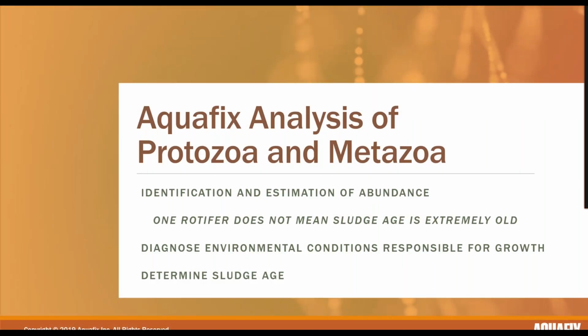And so with all of these protozoa and metazoa within a wastewater system, our analysis here at Aquafix really starts with the identification and estimation of abundance of each particular organism that's present within a wastewater sample.